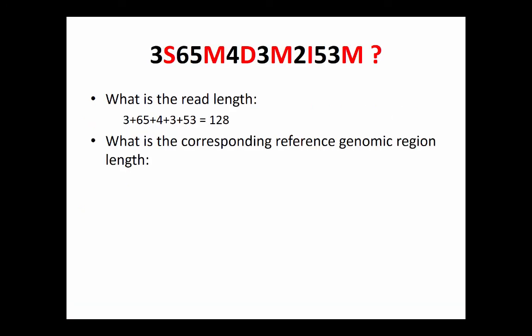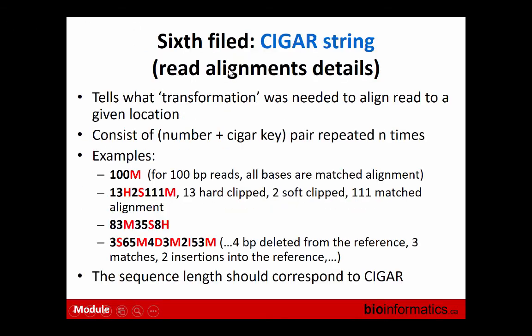I have different quizzes there about what this means. So a CIGAR can look like this. It really looks ugly. The most simple way is this: here's an example. If we have 100 base pair reads, then the nicest CIGAR is 100M. So we had 100 matches, nothing else.